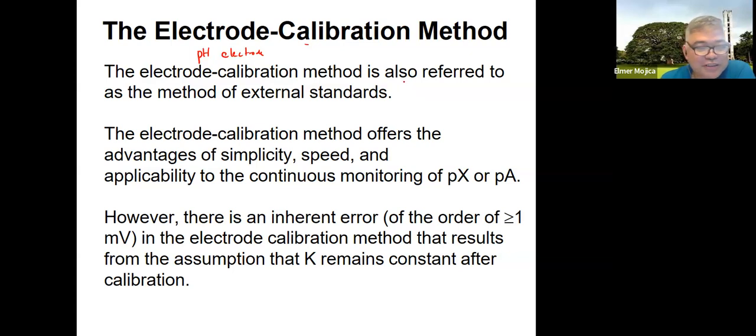I need to do it to the 3 pH meter that was given to me. So you usually put the standard there of pH 4, pH 7, and pH 10. The lab tech told me if it's still working, go ahead. So I put them in pH 4 and some of the readings are 4.17, 3.87. So I think it's still possible to fix them. Okay.